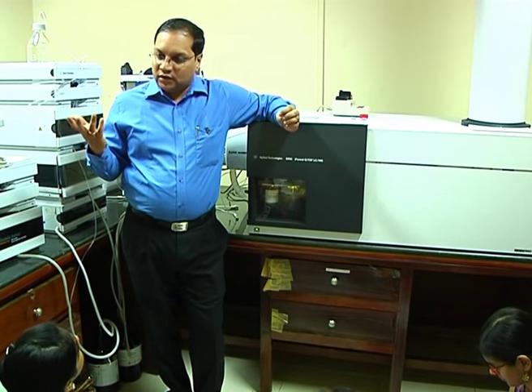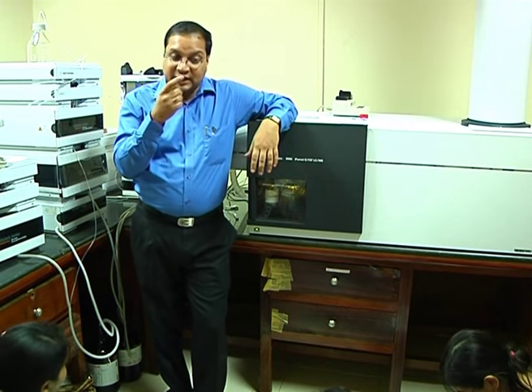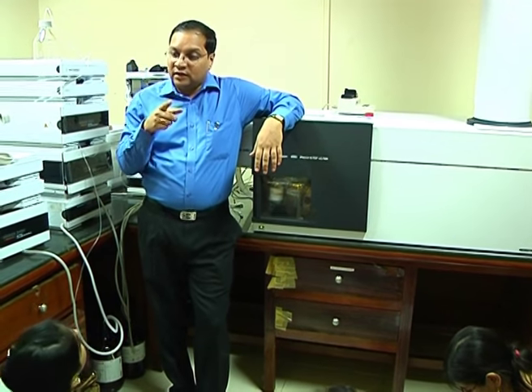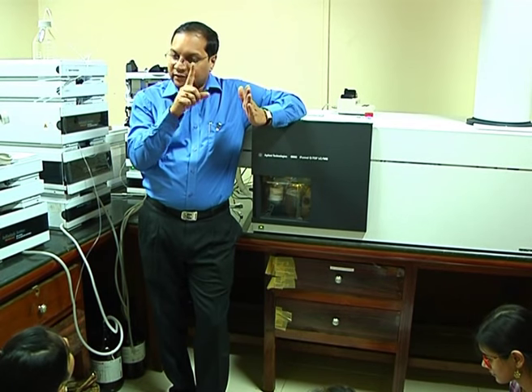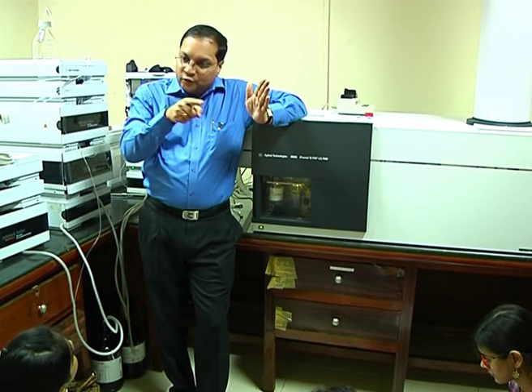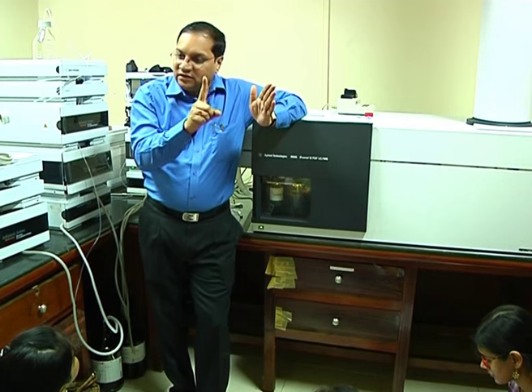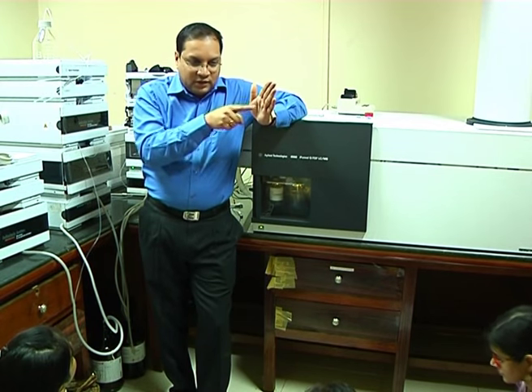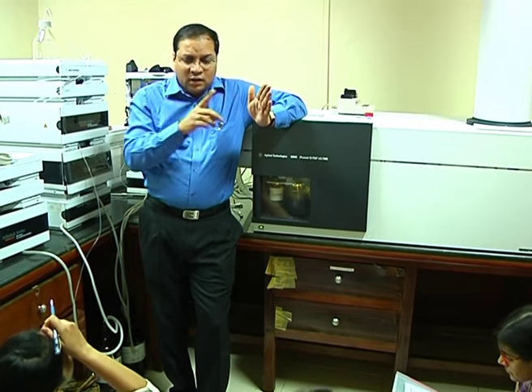If my TOF is scanning 1 spectrum per second, meaning my cycle time is 1 second, it will start from 5, go to 3200 and come back. It happens in 1 second. It will take 1 second to scan completely whatever I define.